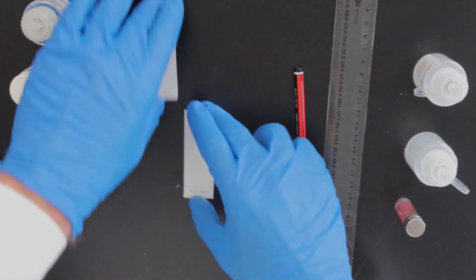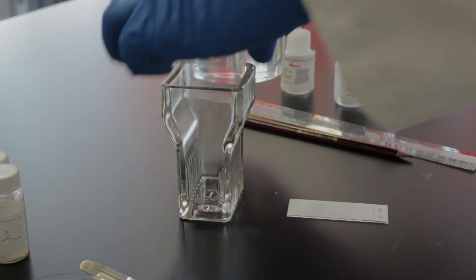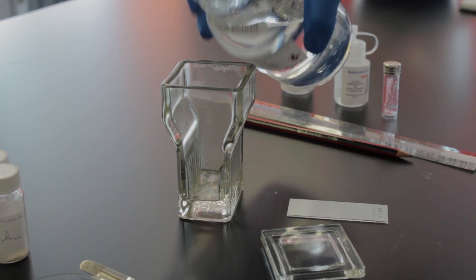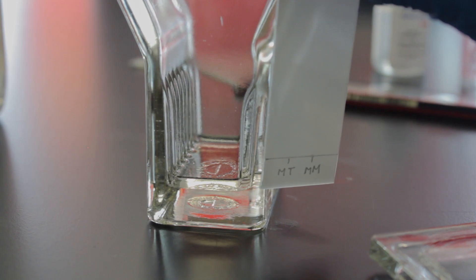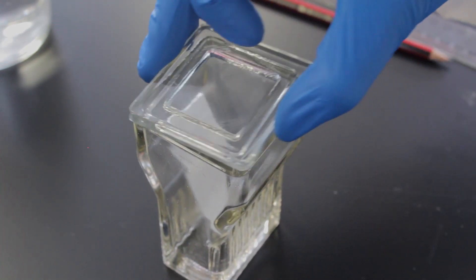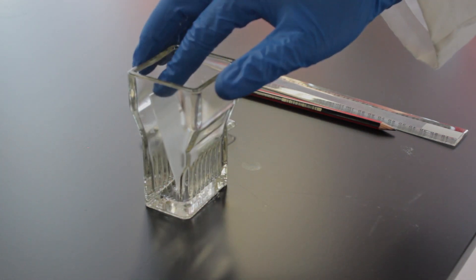Now both of our TLC plates are ready to be developed. Let's set up our TLC chamber. For this experiment we're going to use an eluent that is a mixture of dichloromethane and ethanol. Fill up your TLC chamber with about 10 mL of your eluent, making sure that the solvent line does not submerge your sample line. Carefully pick up your TLC plate and place it inside the chamber, then pop the lid back on and let the mobile phase move up the plate. Try not to disturb the chamber too much by moving it around during the development stage.